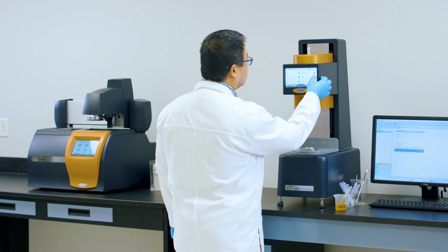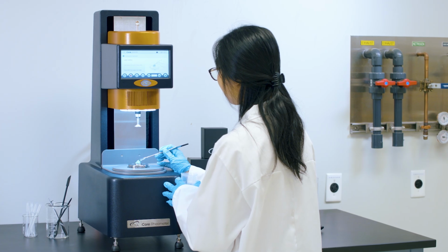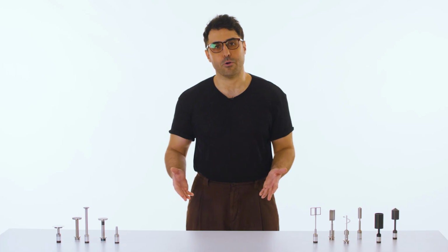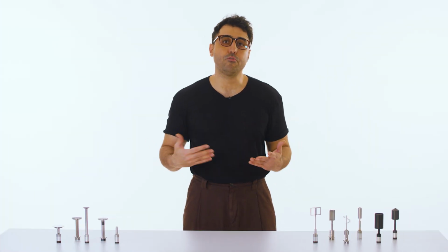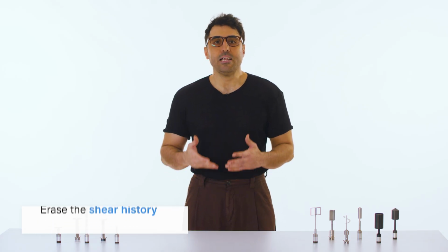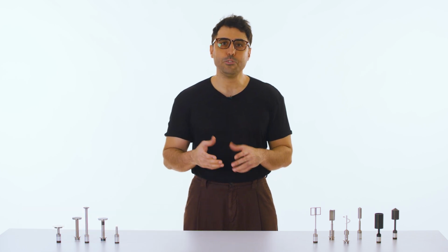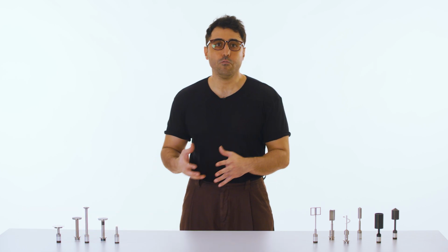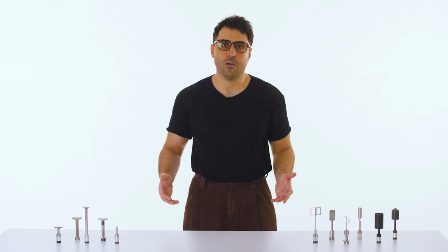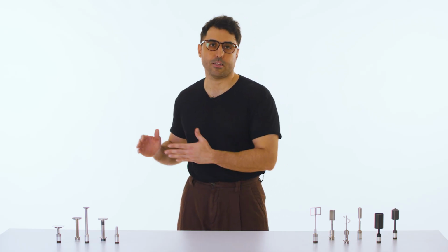Two people can run the same test on the same paint and get noticeably different results simply because the material's microstructure had a different starting point. The best way to improve repeatability is to erase the material's shear history and establish a consistent initial state. A simple approach is to apply a relatively high shear to fully break down the structure, then allow enough rest time for the material to recover and return to a controlled starting condition.